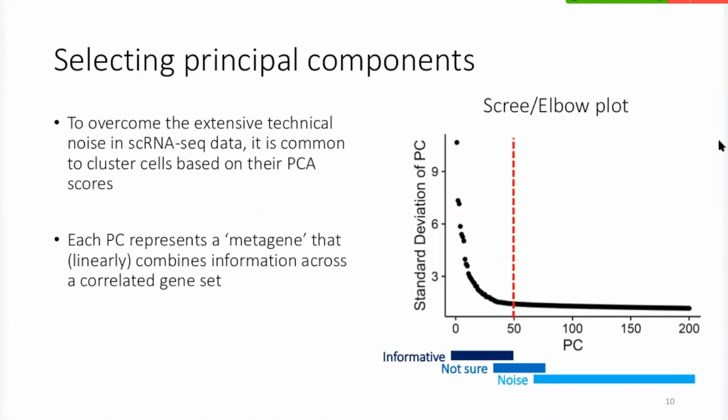You just heard about dimensionality reduction, so again, the same idea. We very often reduce the dimensionality of the data using principal component analysis before we go into clustering. The reasons are very similar to why we do feature selection. We expect the main components of the data to explain most of the variation, that's how we create them, and all the smaller components carry small variation in the data, which we don't care about and want to throw away.